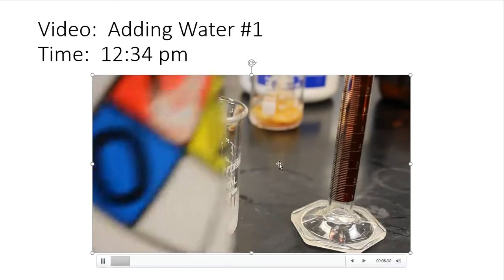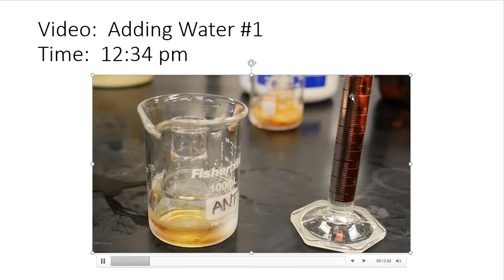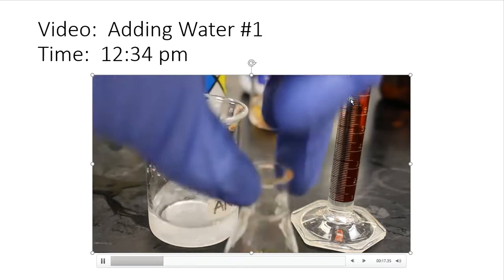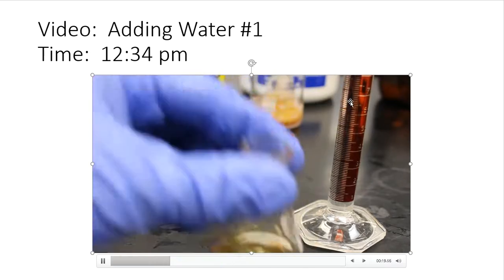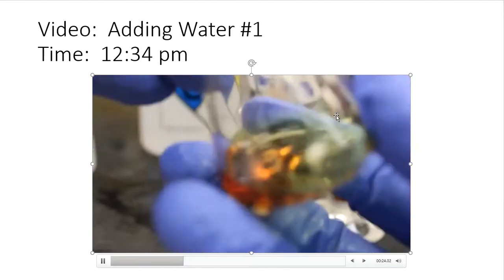It tells me 10 mils. Here you see the graduated cylinder over on the right hand side. I'm going to fill this up to 10. It doesn't have to be perfect, folks. I just need it to precipitate out if that's what it's going to do. So let's take a look together. Let's record those observations down because, again, you know they're going to be asked.